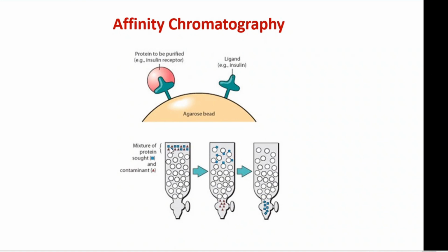There are two types of molecules you can see here, blue colored squares and brown colored triangles. You see these blue squares have ligands in the matrix, so they can get attached to that particular matrix. Whereas these brown triangle molecules don't have any binding capacity in the matrix. So they will be released and moved along with the solvent, or the mobile phase. Okay, so after this, what happens?